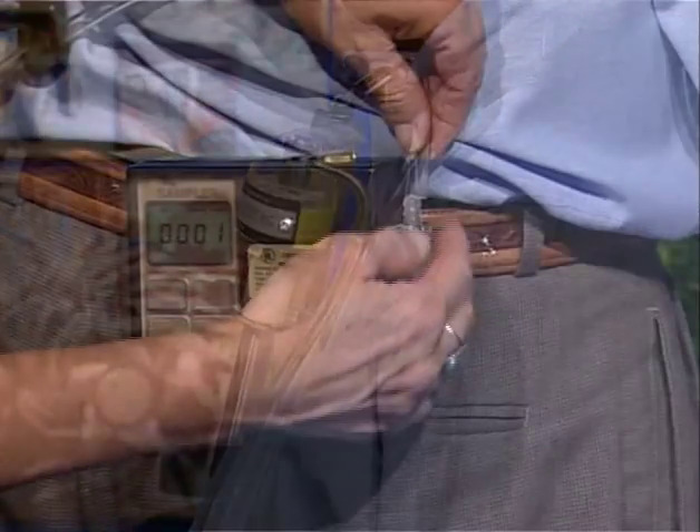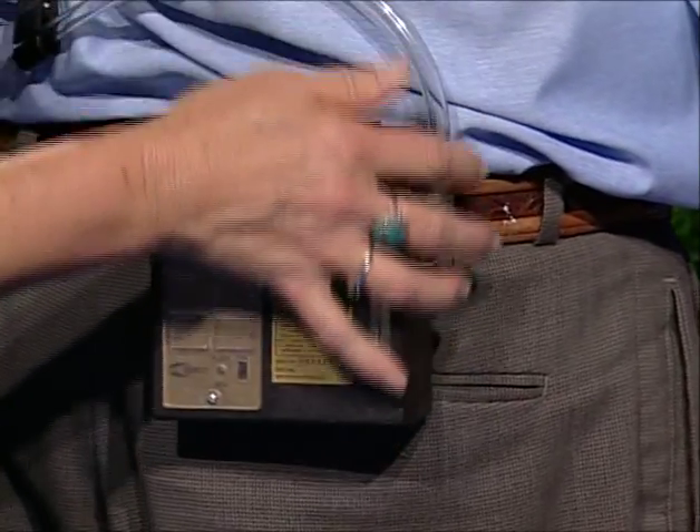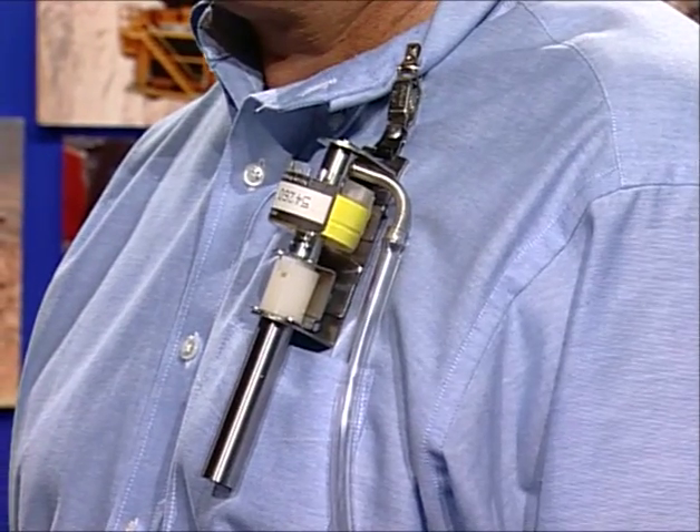Connecting the parts of the sampling train is straightforward. Connect the tube from the pump to the cyclone. Ensure that the tube is long enough so the pump can be attached to the belt and still permit the employee sufficient movement to do his or her work.